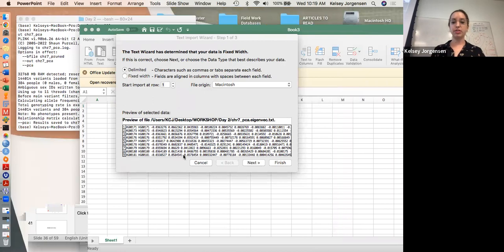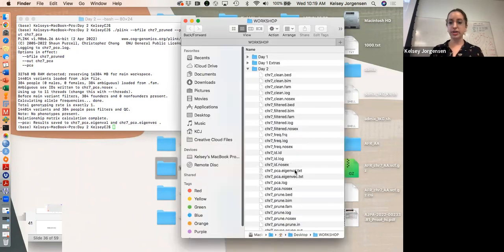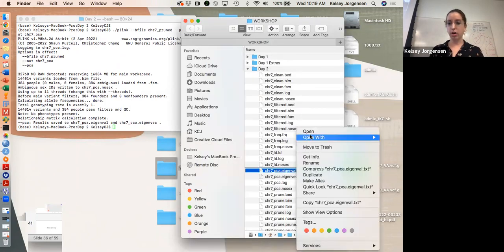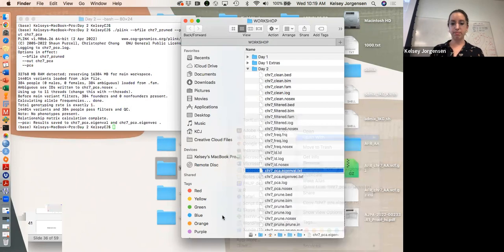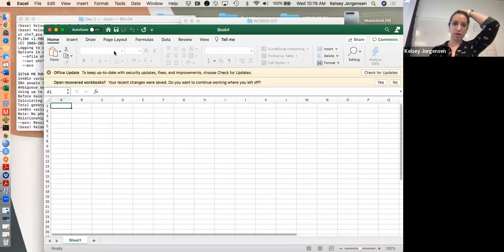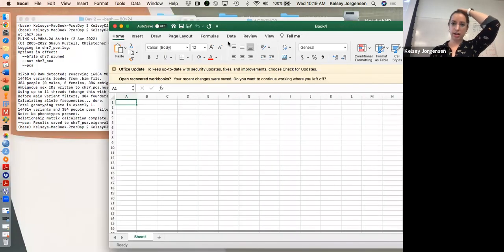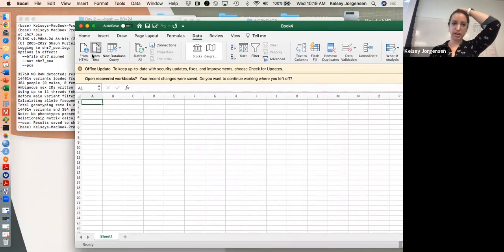this is again personal preference, so I'll show you how I do it. There are a few other ways you can do it. I think you could do open with, but basically what I do is I open a blank Excel, and then I go to data. I'm sure Dan has a bunch of different ways too.